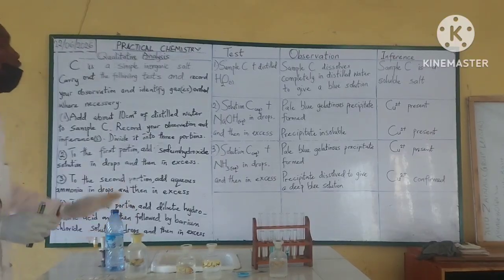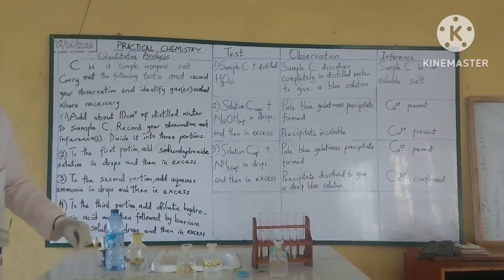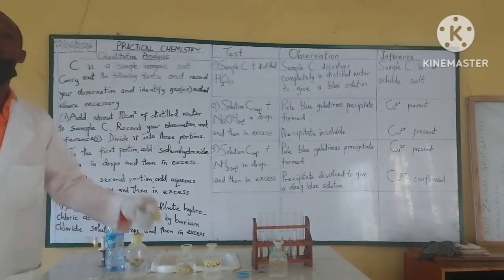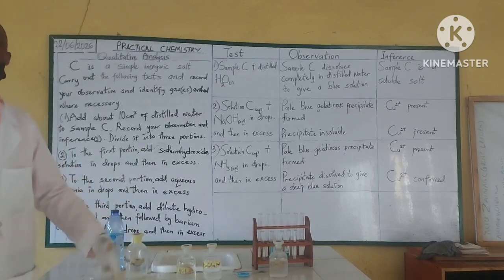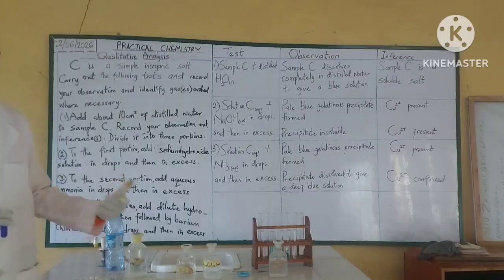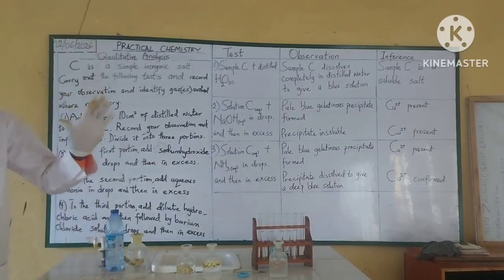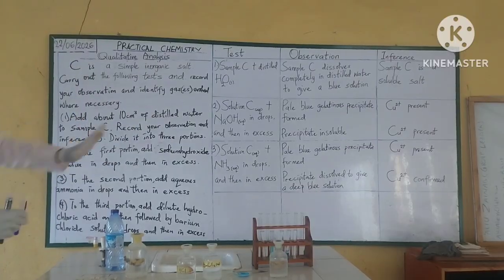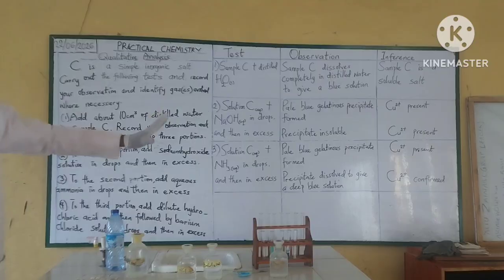These are the major ones. Once we make use of sodium hydroxide, we use it to carry out a test. We make use of aqueous ammonia or ammonium hydroxide solution in order to confirm what we have tested with sodium hydroxide. That is when we are dealing with a metallic ion or cation. Now we are done with one aspect, which is the test for cations.